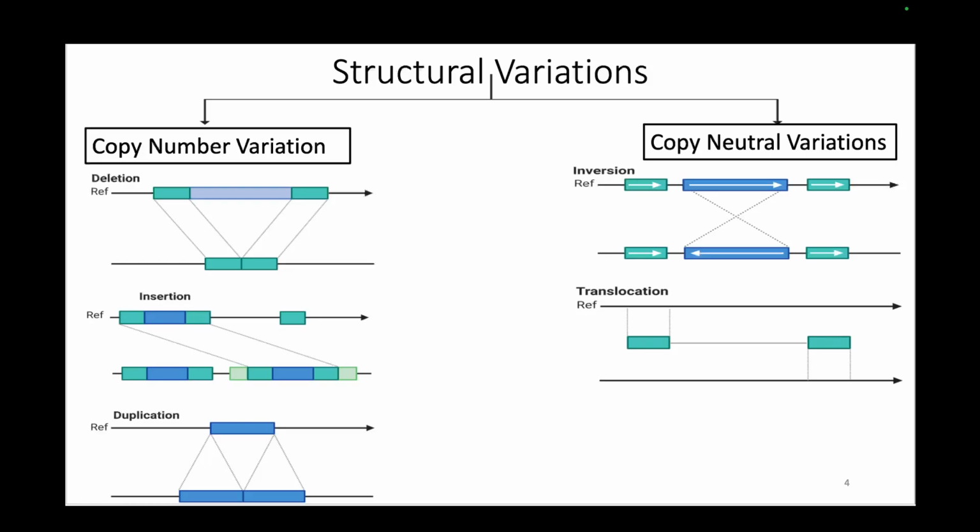But there you also have to think about the fact that the Y chromosome has a lot of repeats, so it is very hard to claim that a duplication has taken place in a region of the genome where there are a lot of repeats. There are all these caveats. You need enough evidence to confidently say this part of the region has been duplicated or deleted or inserted, because it's a big chunk of DNA. It's not a small one.